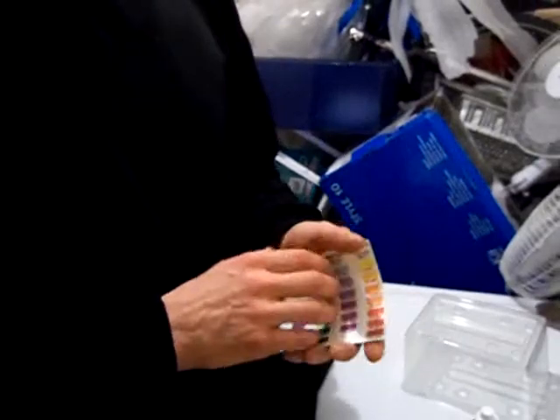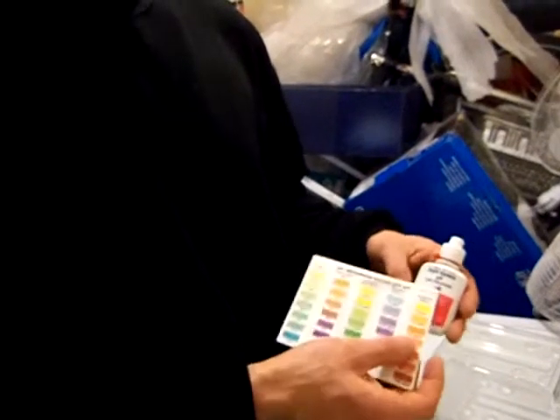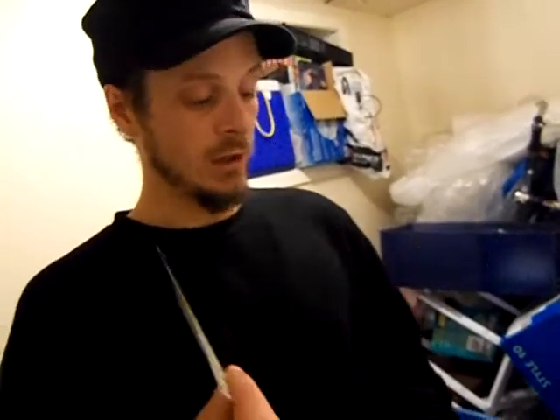Between using the API and the store we go to — they use the Nutrafin test kit — from what I can tell, Nutrafin doesn't do a high range and a low range, and I don't know exactly what range they go up to. But I'm finding the API far more accurate. I went to do a water test today on our 45 bow that I was afraid I polluted last night. They told me I had no ammonia, no nitrite, and no nitrate. When I did the test here, I found no ammonia, no nitrite, but trace amounts of nitrate. So we're at the end of the cycle — we've got beneficial bacteria that within about a 24-hour period can take care of ammonia and nitrite, which is really good, and nitrates were almost completely gone.